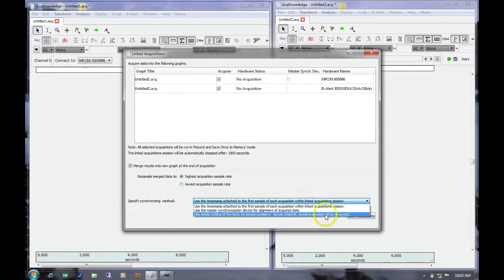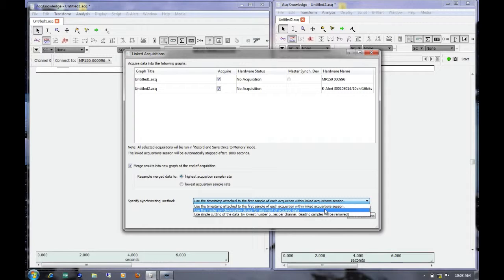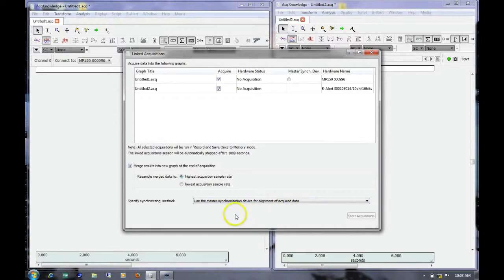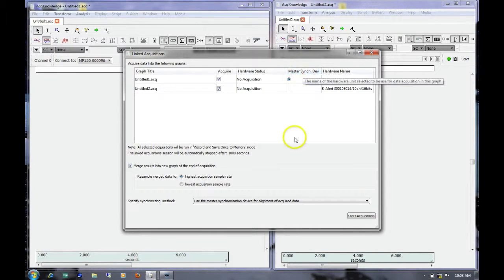The other options include using simple cutting of the data by lowest number of samples per channel, which synchronizes the signals based on the last sample of data. Then there's the option that we're going to use: use the master synchronization device for alignment of acquired data. This option can only be used with MP150 and BeAlert linked acquisitions. Once we've selected this, we can then enable the radio button for the MP150 to be the master synchronizing device.